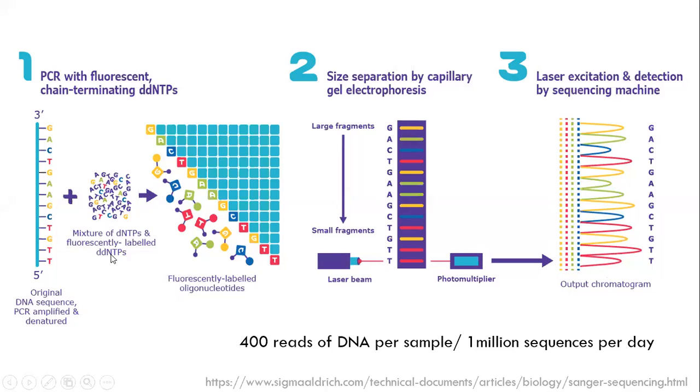And then at the same time, as Sanger explained, you can stop the synthesis reaction anytime. You can give dideoxynucleotides also. You can also label them. You can give them in a solution. But remember that these ddNTPs go and stop this reaction at random steps. They don't stop at, for example, this 13 nucleotide template DNA here. So it very randomly goes and stops the reaction.